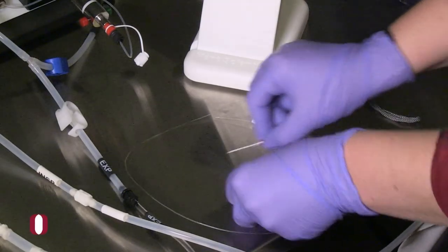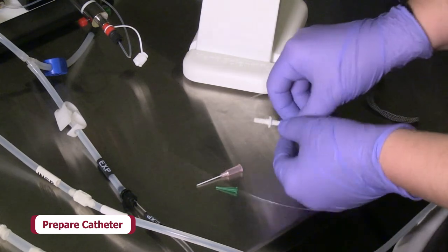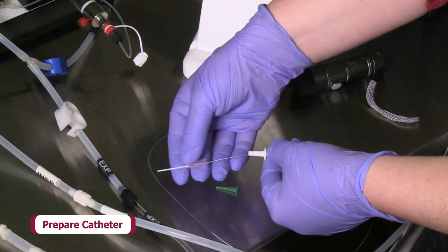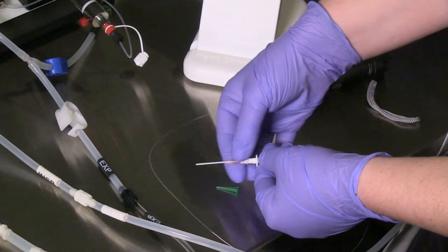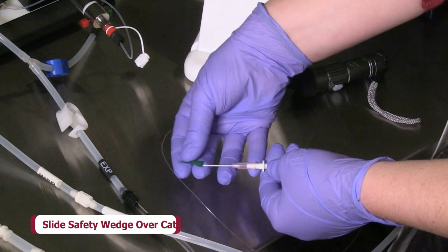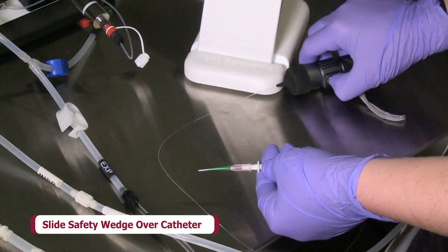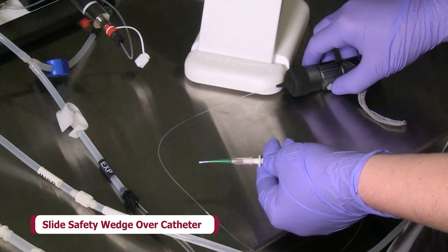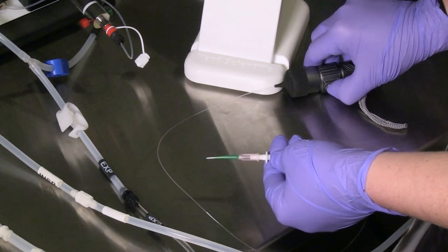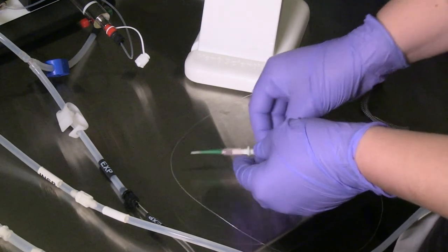Next, prepare the catheter for intubation. The intubation tube safety wedge is designed to assist in insertion of the catheter into the trachea and reduces leaks during ventilation. To attach the safety wedge, slide it over the catheter until it reaches the hub of the catheter and press it onto the tip of the fiber optic guide wire handle. Turn on the light source and adjust the fiber optic guide wire until it extends approximately three to five millimeters from the catheter tip.